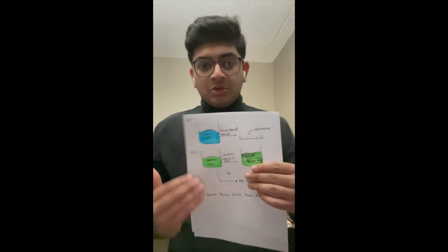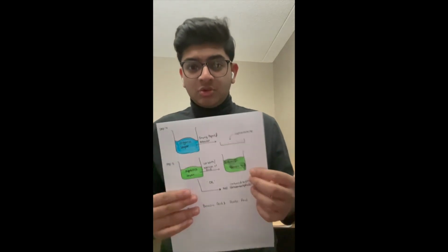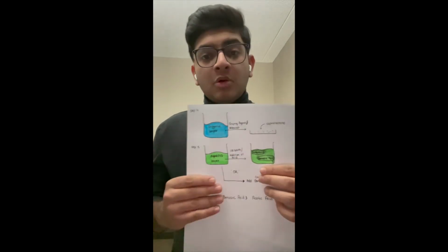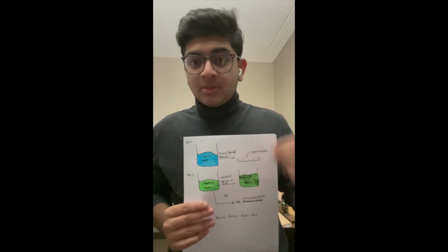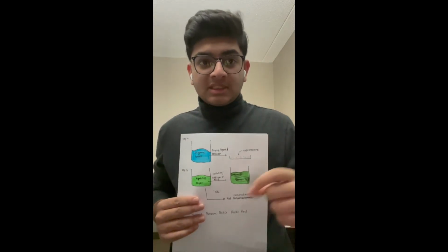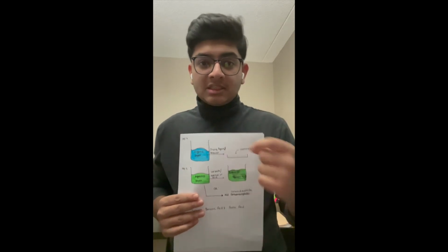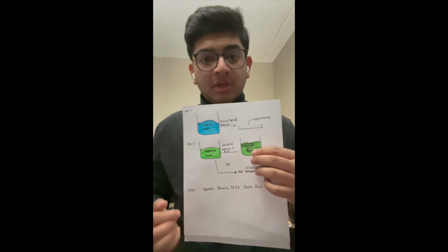Now, moving on to our aqueous layer, there are 2 ways that I came up with which we could use to separate the benzoic acid and acetic acid in the purest form. The first one is that we let it cool down to room temperature and start adding acid, which would protonate our benzoic acid and acetic acid. Now, benzoic acid at room temperature is insoluble in water because of the 6-membered ring that it has, while acetic acid, because it has a shorter hydrocarbon chain, is very much soluble in water even at room temperature.